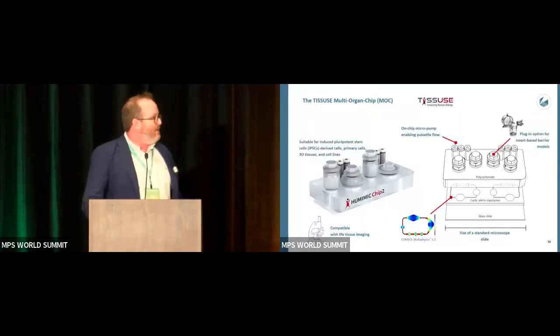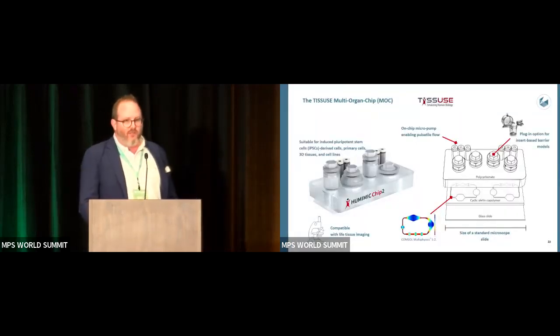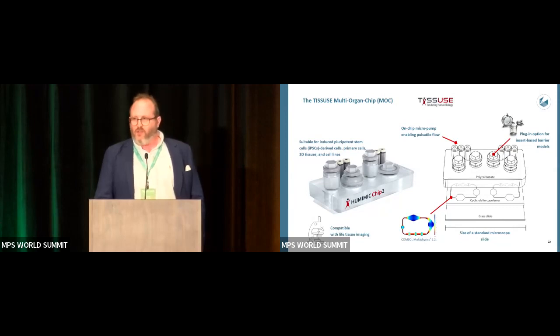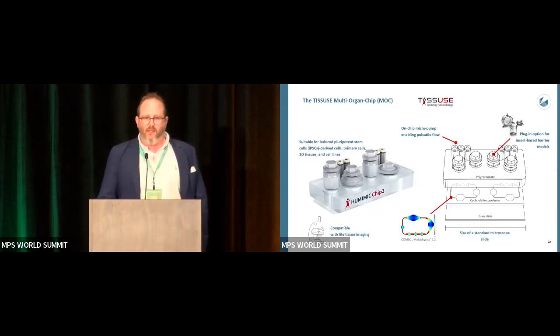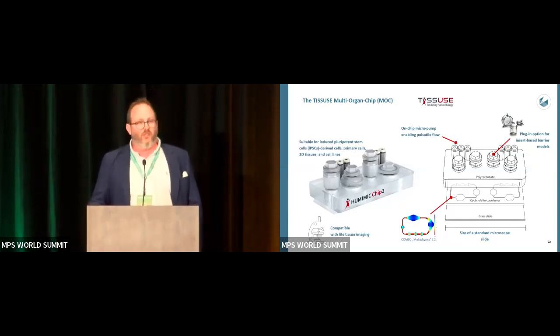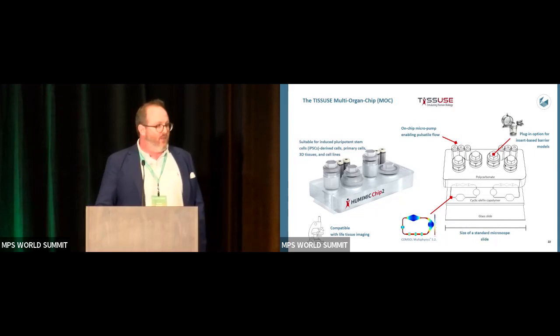So now we come to the tissue system that I guess most of you already know. What we envision, and what we're working on together, is to implement this chip into the inhale system in order to also add the systemic component. So not only having the lung, but also what happens after deposition in the lung, for example in the liver, or what happens if you have the uptake and then the metabolism.